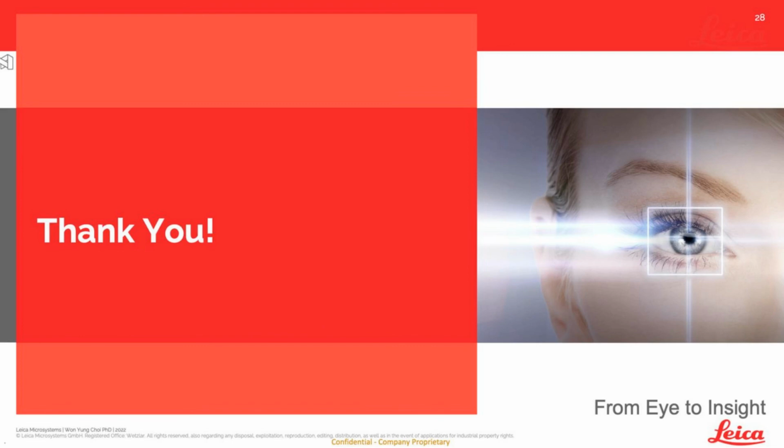Next question here, what about 4D workflow? Based on our current implementation, we are fairly certain that we can handle various types of 4D workflow as well, because we're basically chaining known algorithms and recipes that work in AVIA, and John Stansberry has worked very hard to make this workflow handle as many applications as possible.